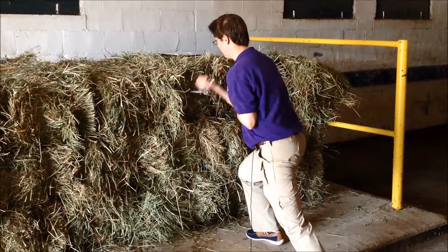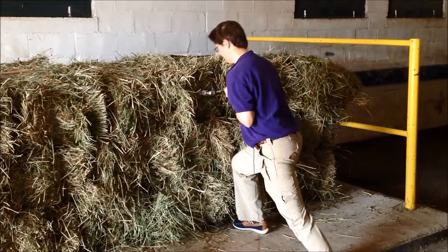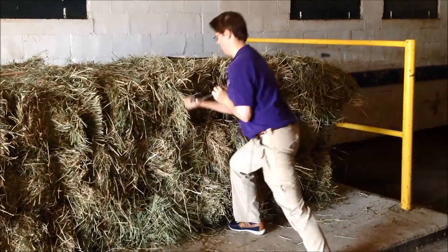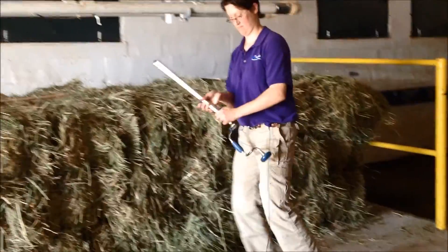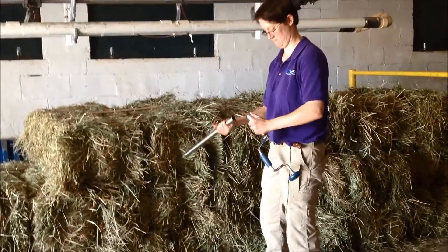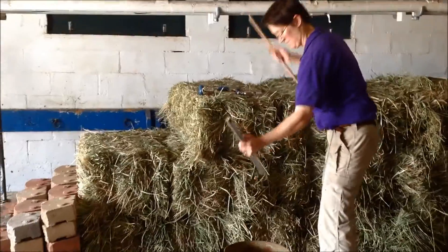The best place to core sample small rectangular bales is through the center of one end. Medium and large square bales do not vary in distribution of leaves and stems across the ends as small square bales do, so they can be sampled any place on the bale end or side at a 45 degree angle to the side.